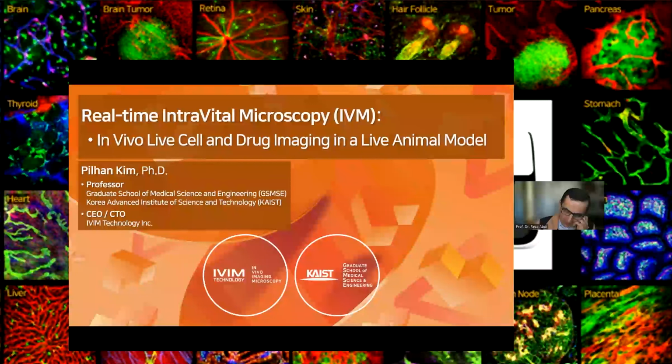I want to introduce this workshop, which is planned March 11th to 15th. Through this workshop, you would get to know the plasticity, the scope of the work you could do with this machine, which is quite small, actually. One of the first things that came to my mind is that this is a very small machine, because I've seen live intravital microscopy which takes probably the entire room. So with that, I probably should start with Dr. Kim, presenting his data and scope of the work.